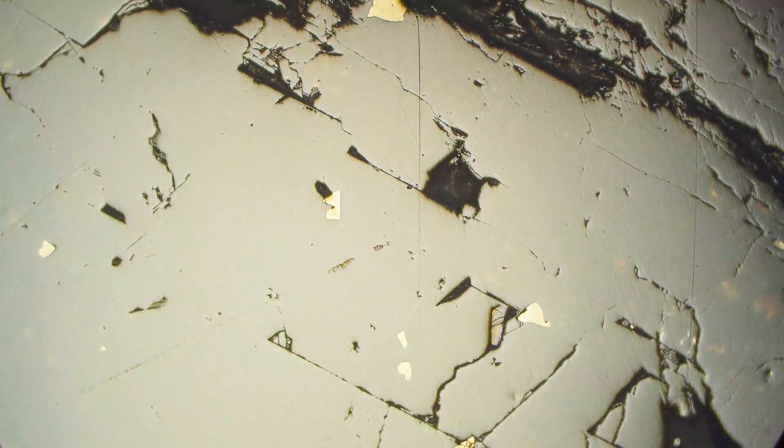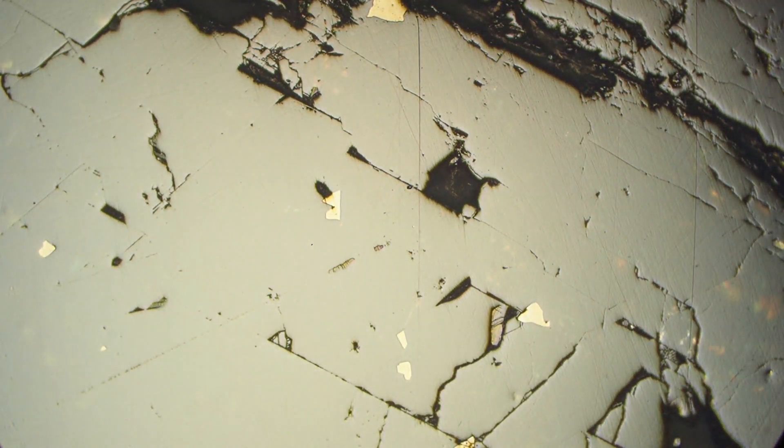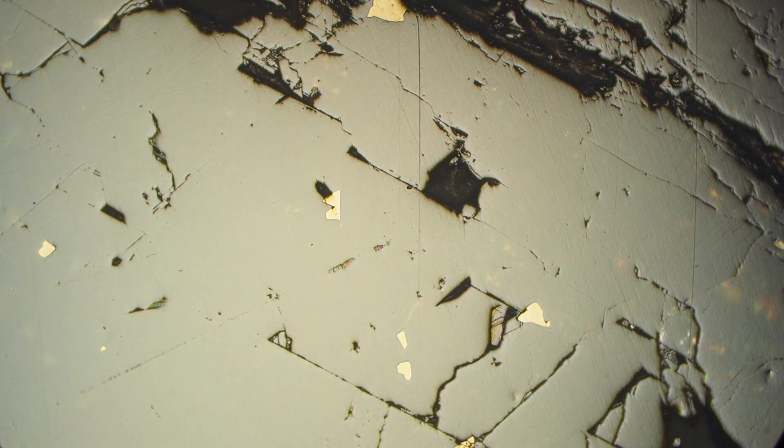It's not changing during the rotation significantly, except for maybe a little bit of twinkling of the internal reflections. Therefore it is isotropic or not anisotropic.